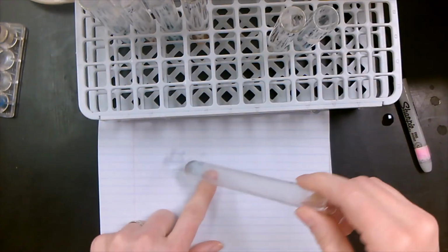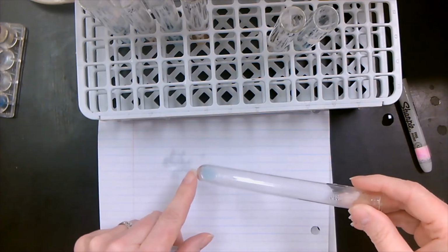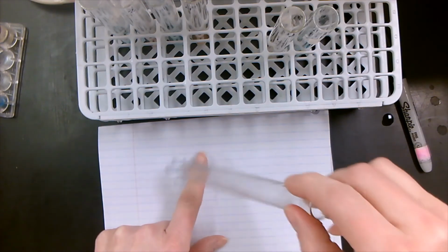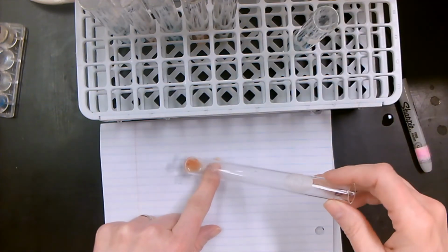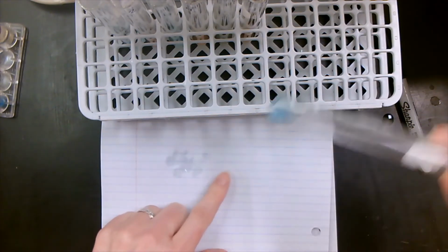This next test tube is the brown sugar. We can see that it's blue, but there's also some orange on the bottom. So this one has a little bit of our glucose, right? It's turned a bit green. This one is our corn syrup. So we can see our corn syrup. The color has now turned brick orange. And finally, this sucrose, or white sugar, has stayed blue.